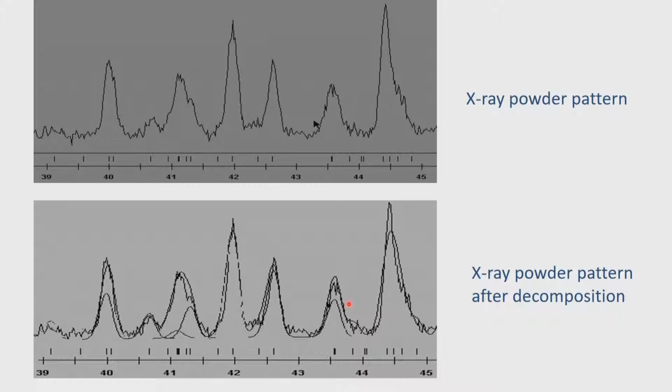peaks. So far we have not brought in the idea of structure. We are not telling where the atoms are and how the atoms are located. We are just trying to fit the profile, and therefore this process is known as profile fitting, which will give an evaluation of the geometry of the situation. If we want to put in the intensity information, that is a different story, which we will see, and that is the one which takes us to the Rietveld refinement protocol.